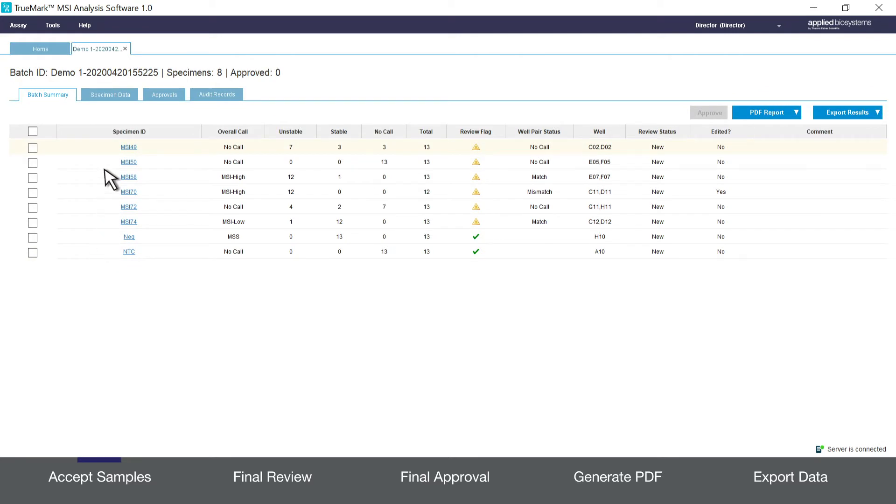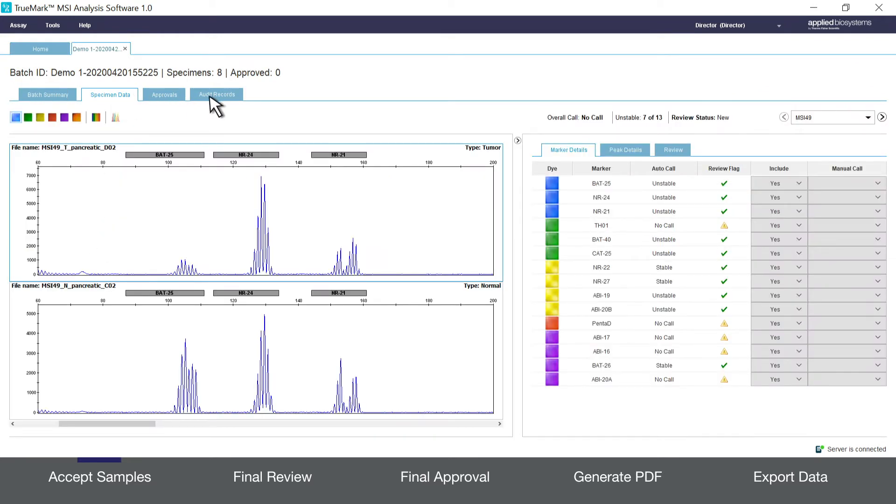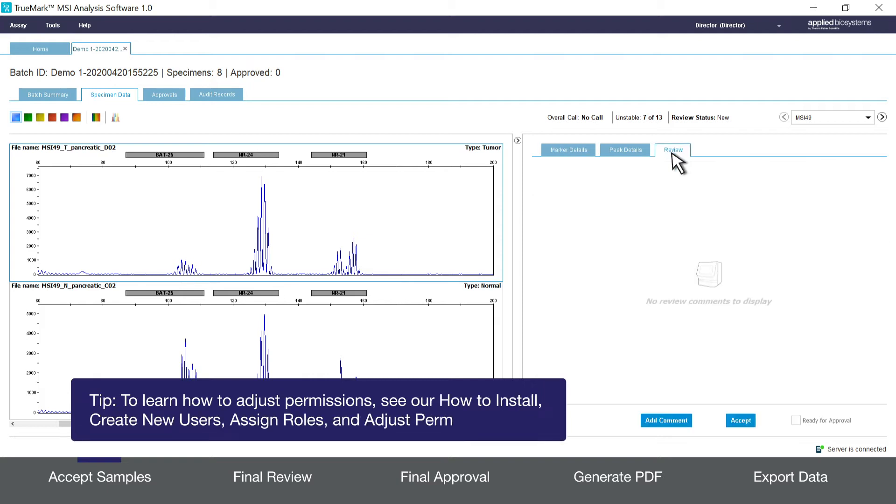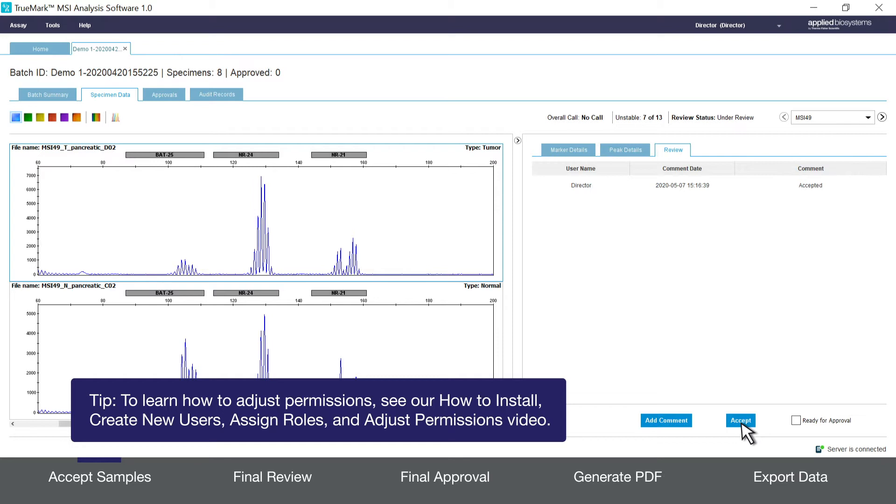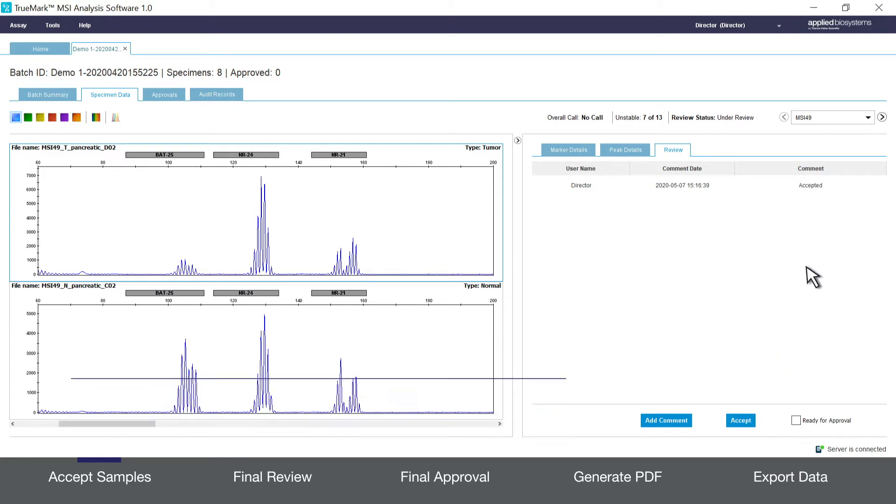Click on the specimen data tab and then on the review tab. Users with the appropriate permission can accept the sample by clicking accept to make it available for final review and final approval. As you approve samples they will show as under review for its review status.